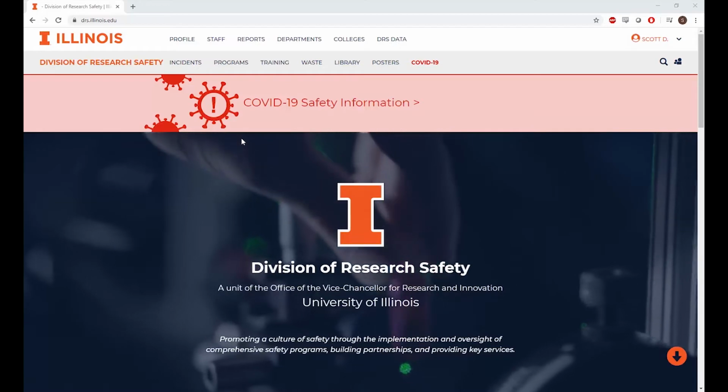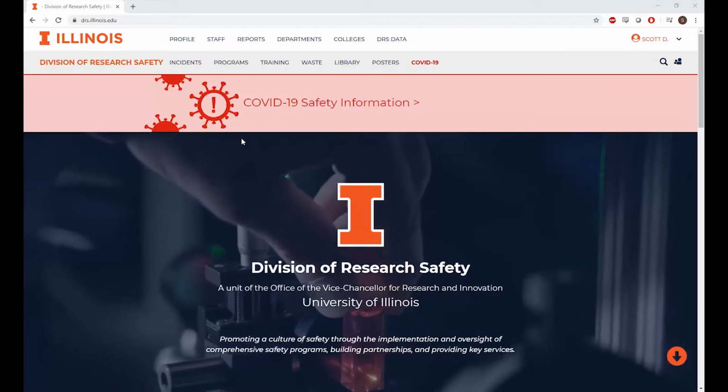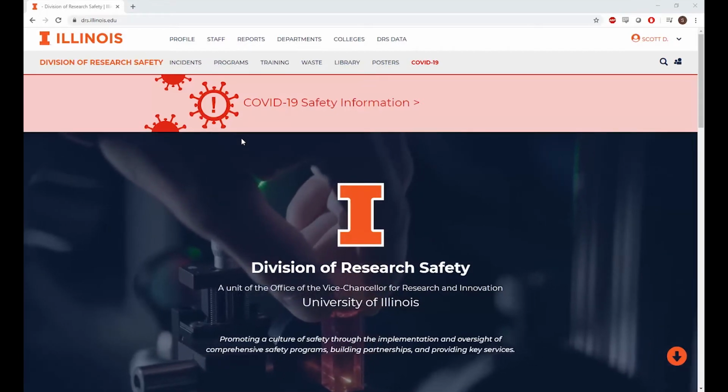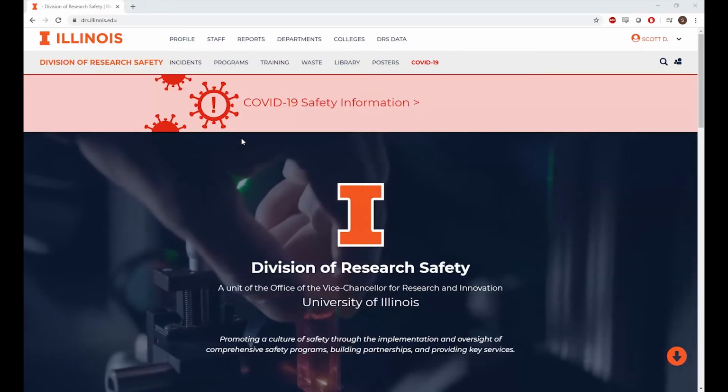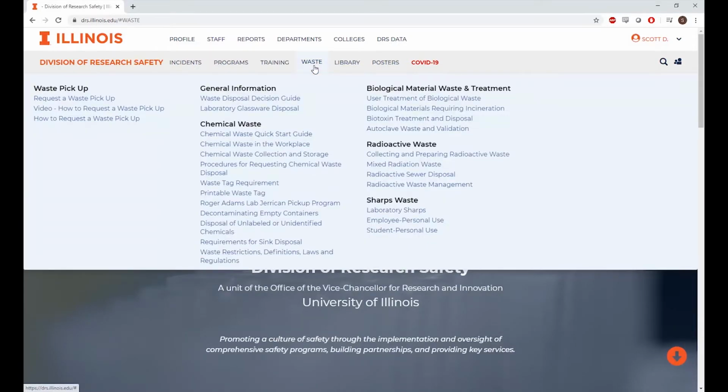The purpose of this video is to provide instructions for submitting a hazardous waste pickup request through DRS. Waste pickup requests are submitted through the DRS website, which is found at drs.illinois.edu. Click on the Waste link in the menu bar on the top of the page. There are several guides and sets of instructions regarding waste contained in this drop-down menu. Refer to these links first with any questions you may have.